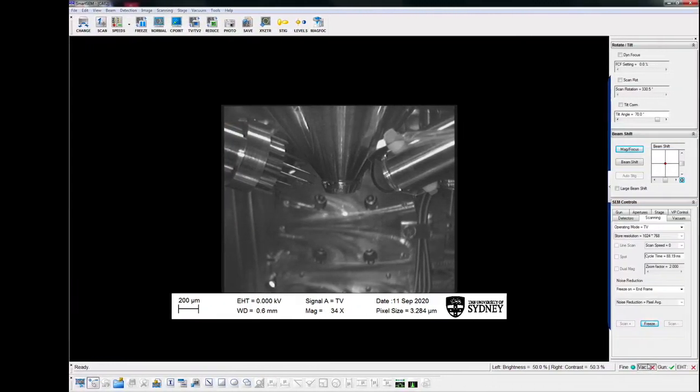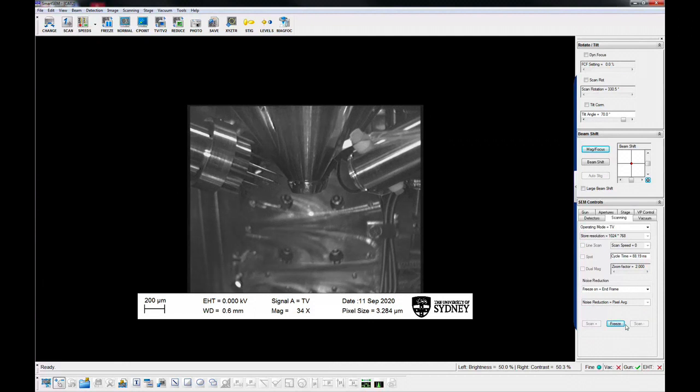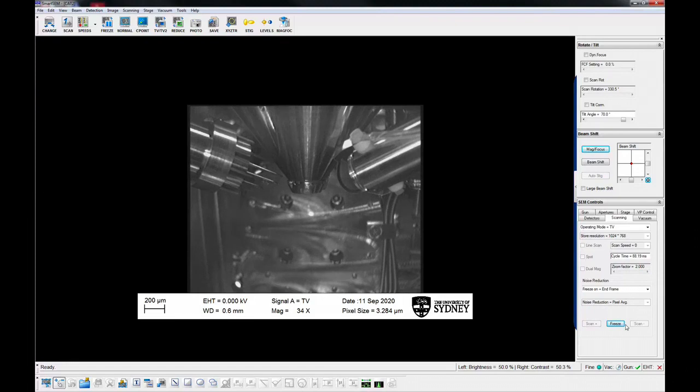With your ungloved hand, select VAC, pump. Carefully unscrew and remove samples from the sample holder and put it back in the desiccator. Make sure the vacuum status is pumping before you leave the instrument.